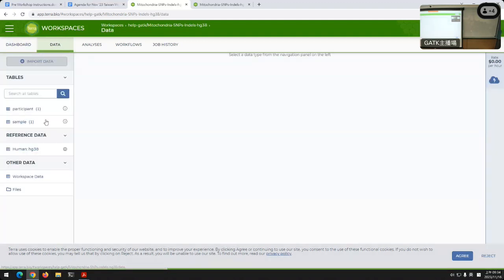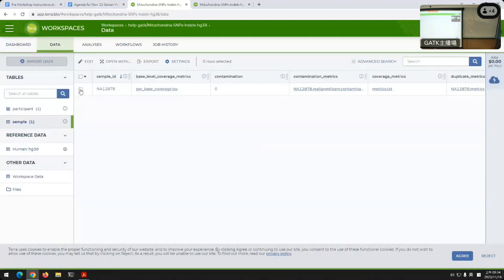But we have our data here. It is, surprise, NA12878.